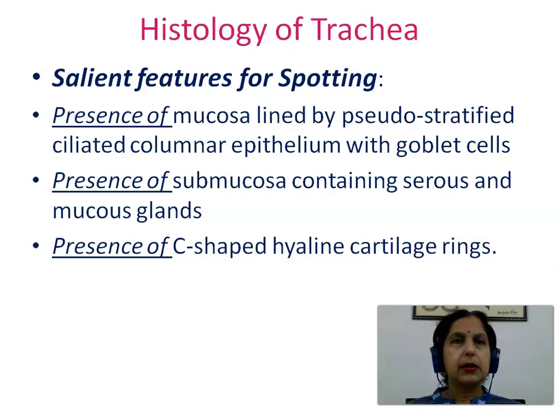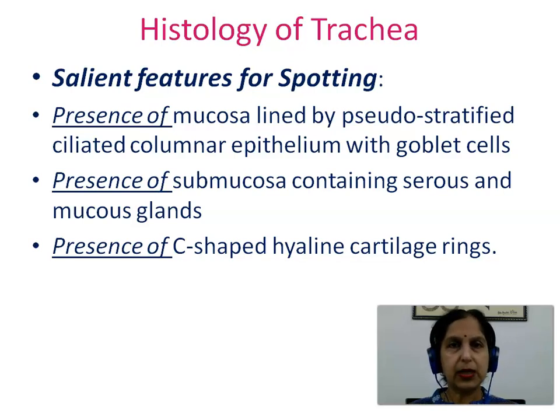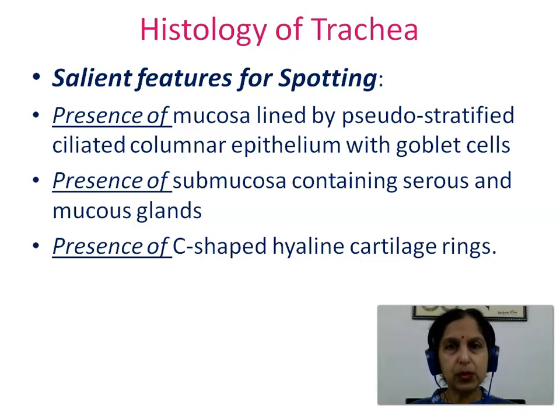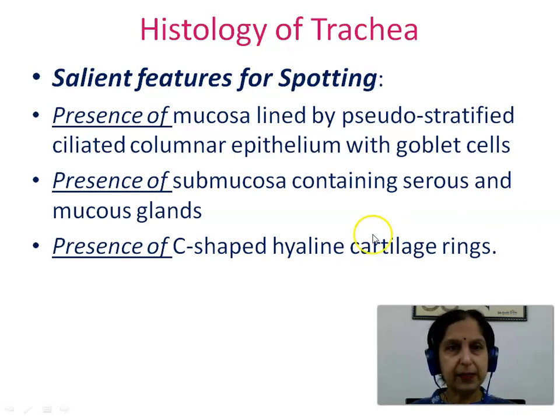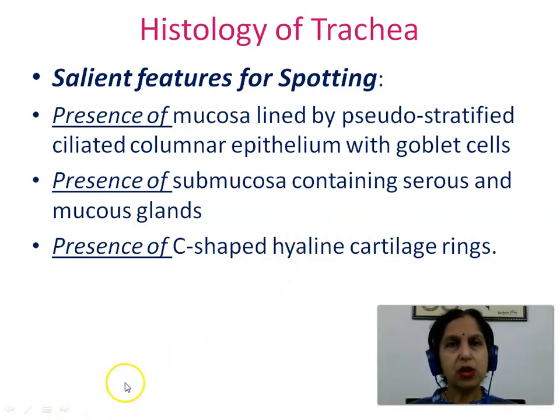The key features for spotting this slide would be: presence of mucosa lined by pseudostratified ciliated columnar epithelium with goblet cells, presence of submucosa containing serous and mucous glands, and presence of C-shaped hyaline cartilage rings. Thus we have studied an important slide of histology of trachea in this video.